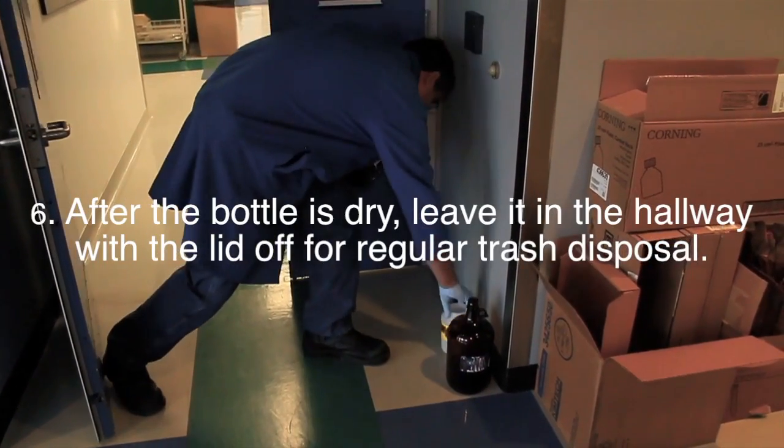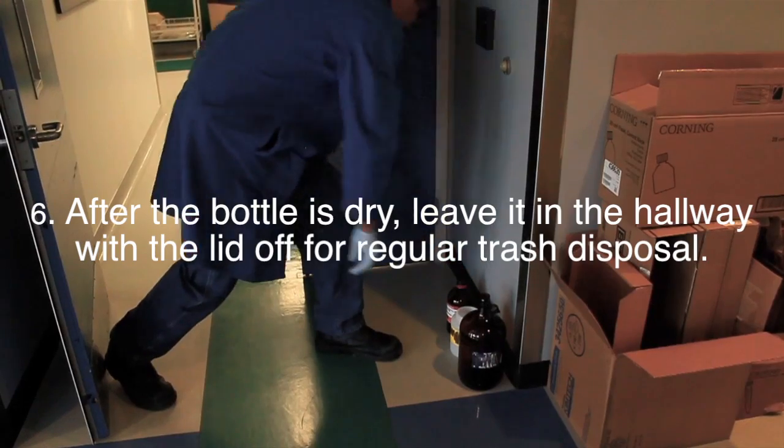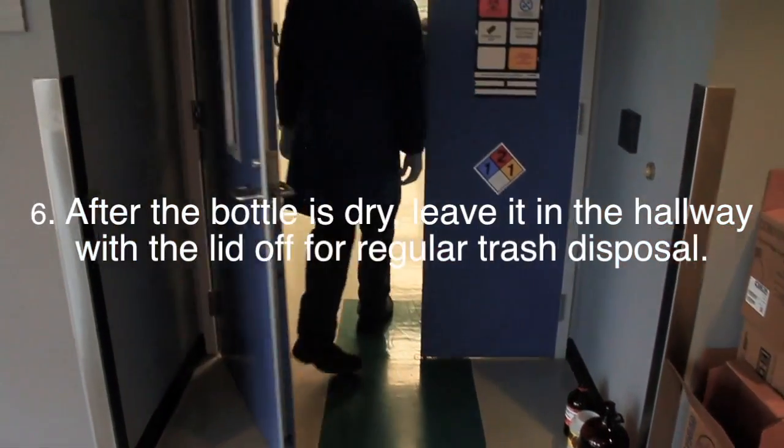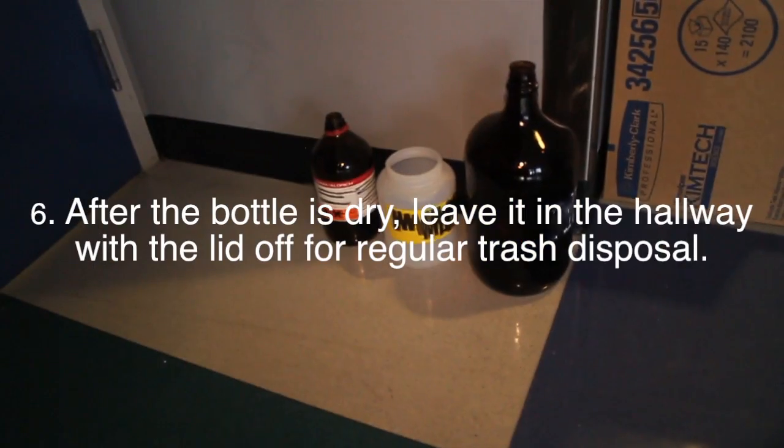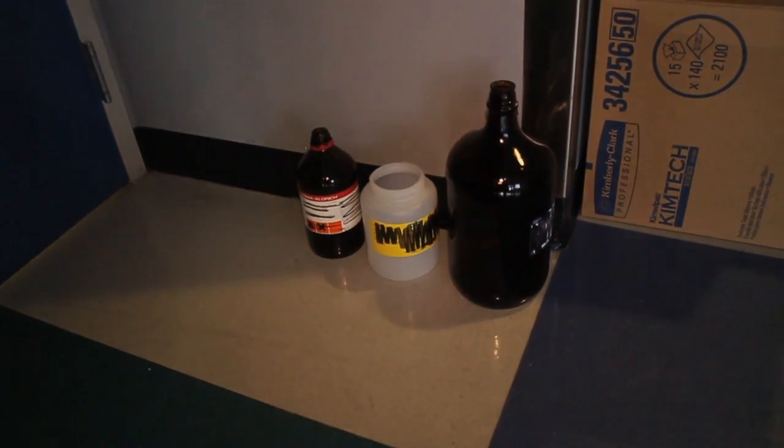After the bottle is completely dry and free of any chemical residue, leave it in the hallway with the lid off for regular trash disposal. Properly defaced empty chemical bottles should look like this.